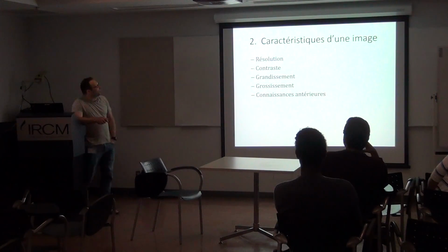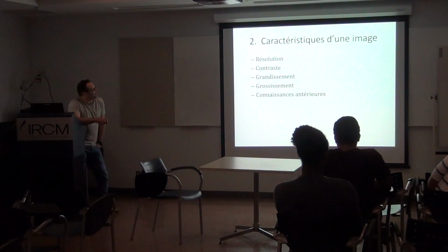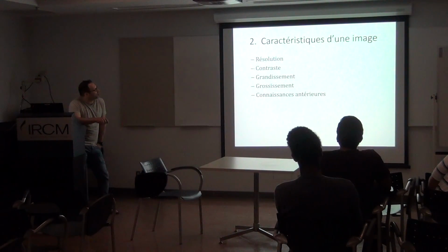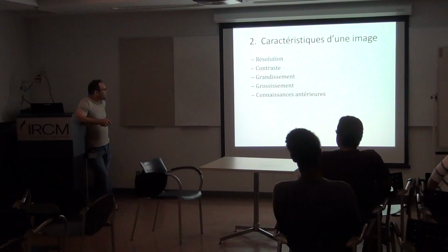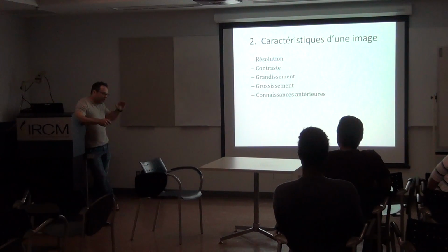Okay. So, image characteristics. What are the characteristics of an image? The resolution is one: the precision of the elements that constitute our image. The contrast: whether we can distinguish things that are just beside each other.